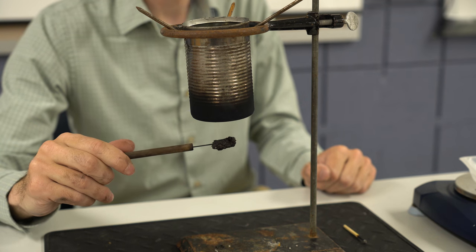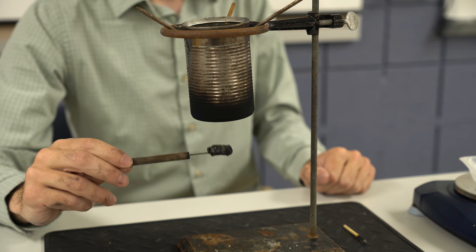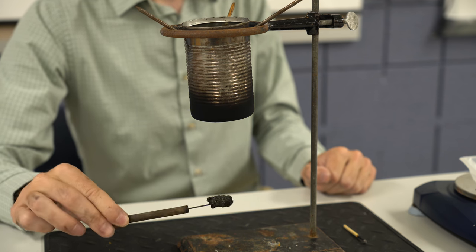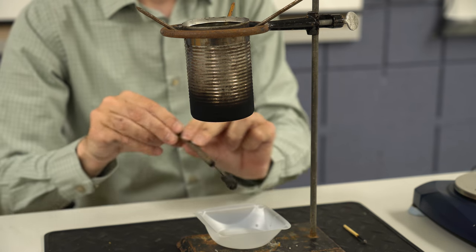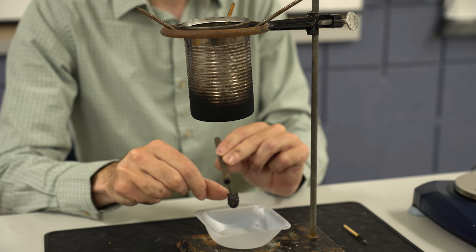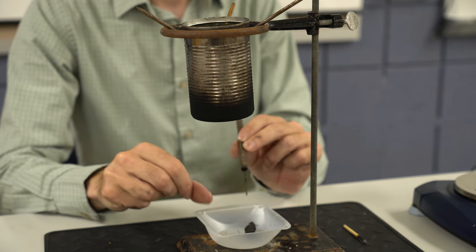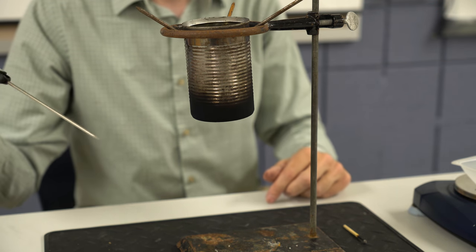Let it go till it's about completely burnt out. See, there'll be a little bit of smoke left. You want to let that cool just for a little bit. Get our weigh boat and kind of make sure it's not too hot. Usually they cool down pretty quick. We're going to watch the metal. Kick that there. We can get that weighed in a moment. That's not going to change too much.